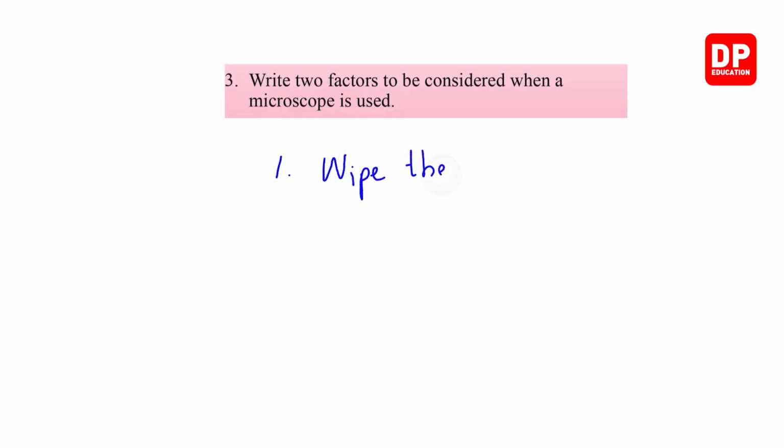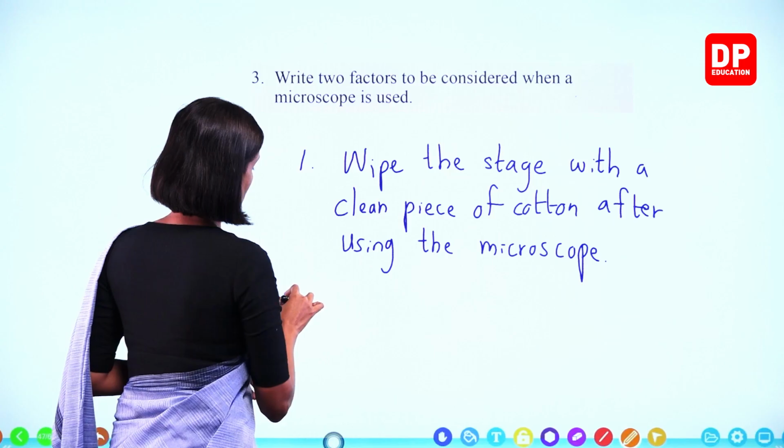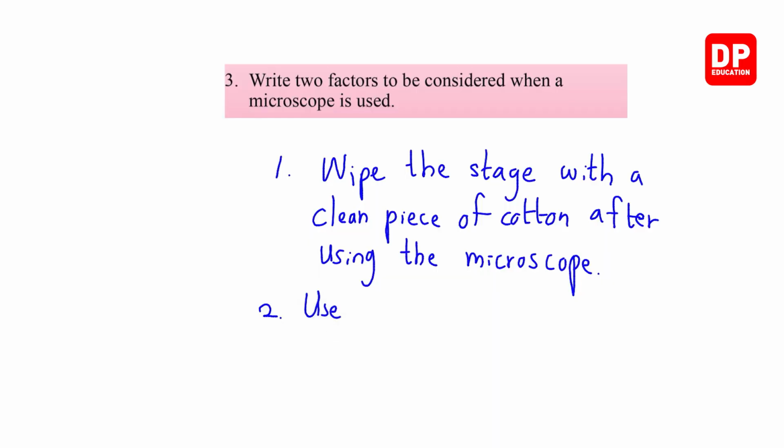Wipe the stage with a clean piece of cotton after using the microscope. Use clean slides and cover slips.